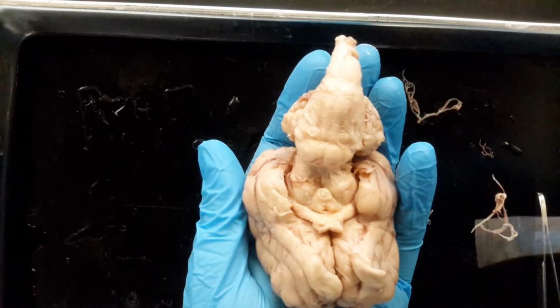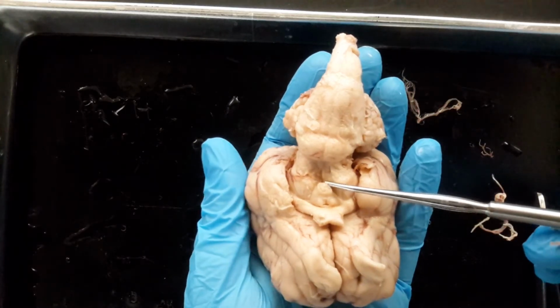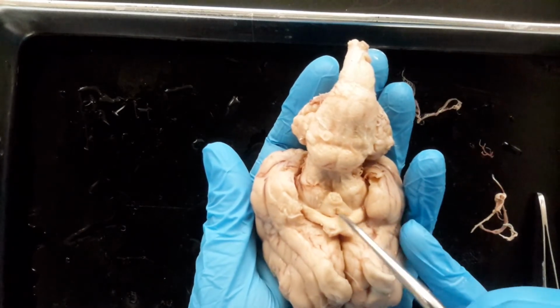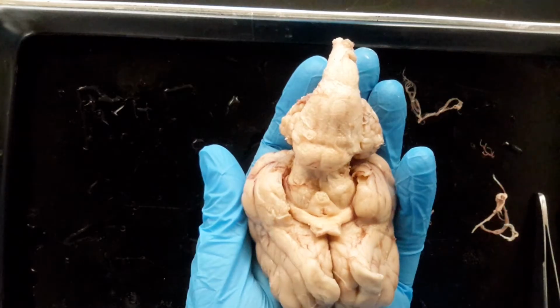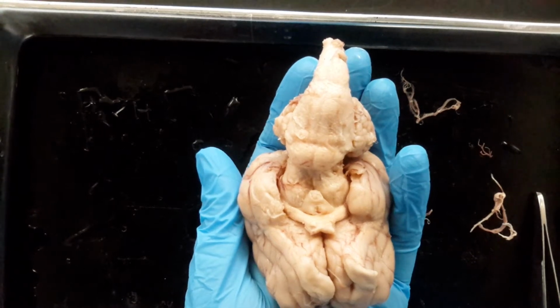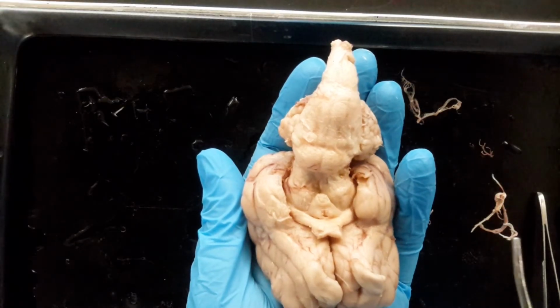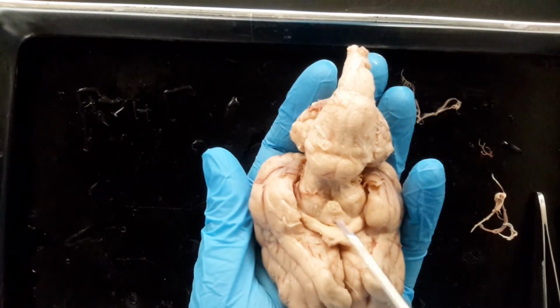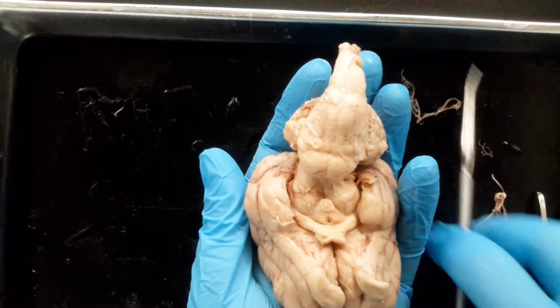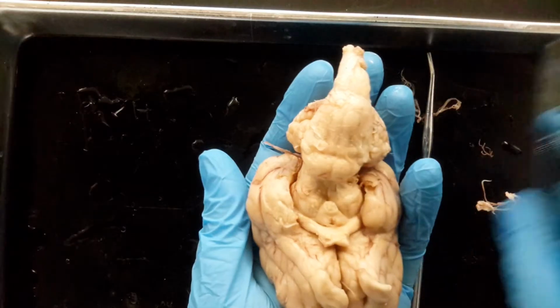A couple structures are easier to see now. See this bump here? That's a little bit damaged, but this bump is your mammillary body. And this little hole here is where the infundibulum would have attached. This brain does not have one. I have one up here that does have the pituitary gland. I'm going to try to dissect it while you're working so that you can see it, but it's kind of hard to do. So mammillary body, this little hole is where the infundibulum would attach from the hypothalamus to the pituitary gland. And then very quickly, a few brainstem structures, and then you're going to clean for a bit.